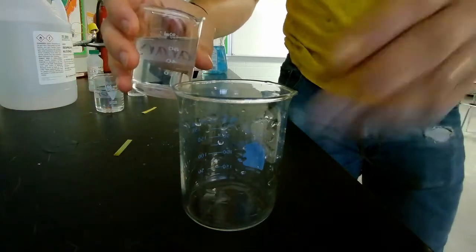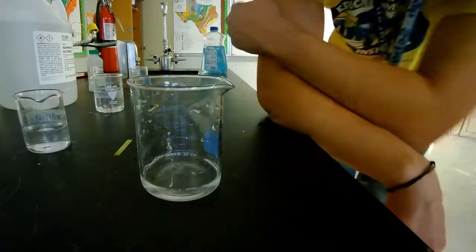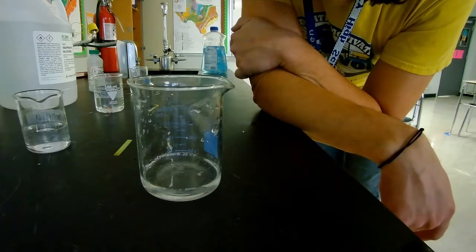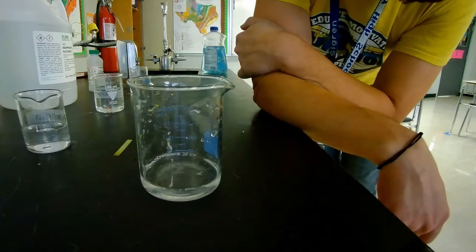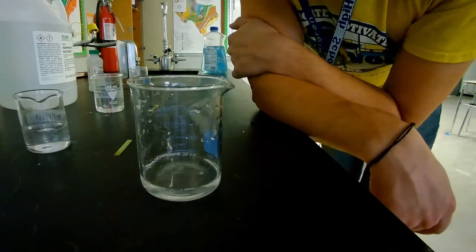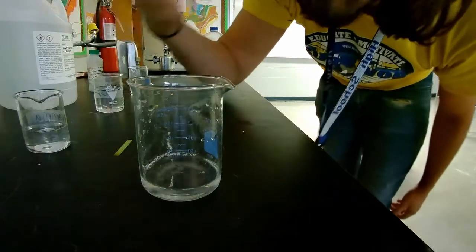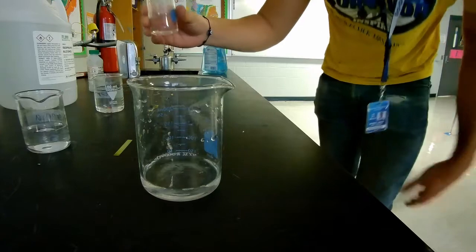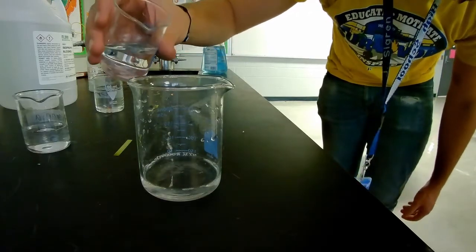Ammonia first. I will tell you, this is one of the strongest smelling chemicals on planet Earth. I can smell it from here. It smells horrible. So that's something we'll keep an eye on. Oof. Yes, that's something we'll keep an eye on, if there's a smell change. Let's add a bit of hydrochloric acid to it.